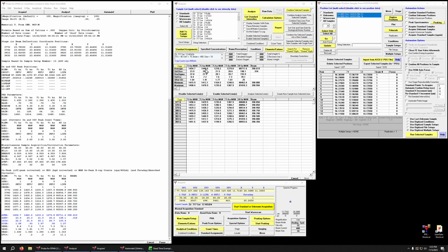And as you can imagine, if your dead time constants are good, we should be able to measure that at greater and greater intensities, and that K ratio should remain relatively constant. This means we have to maybe make a few less measurements, and in my experience, it seems to be much more precise in terms of getting the dead time correct.